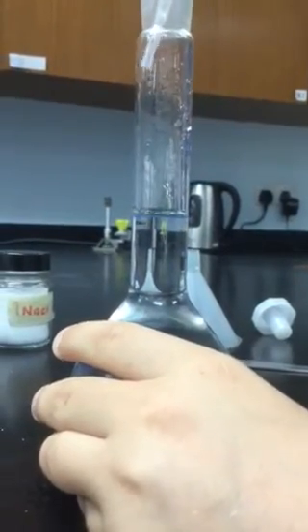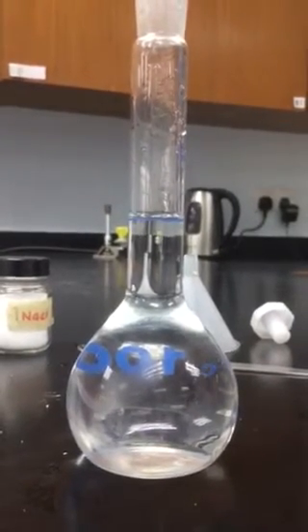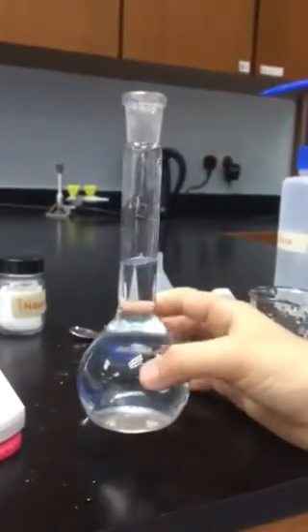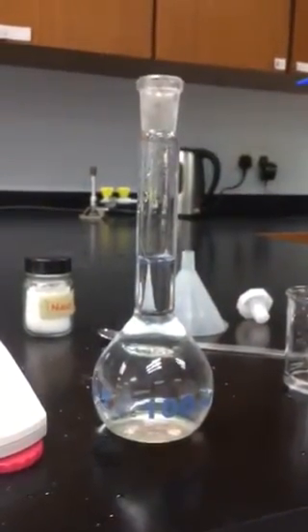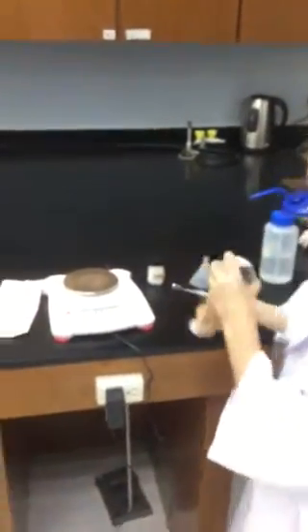Okay, stop. Oh yes, and the bottom of our meniscus is just level with our blue gradation mark. That means in our flask we now have precisely 100 cc's of solution. But now we need to mix that. Nina, could you put the lid on the flask and invert it 5 times?